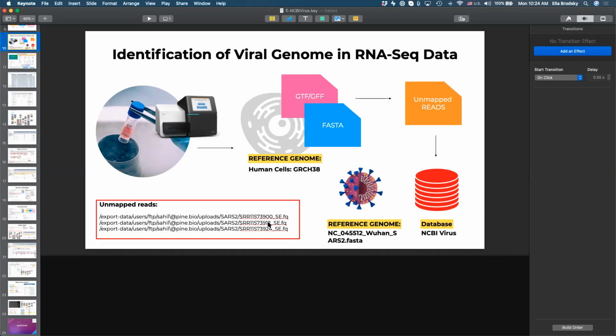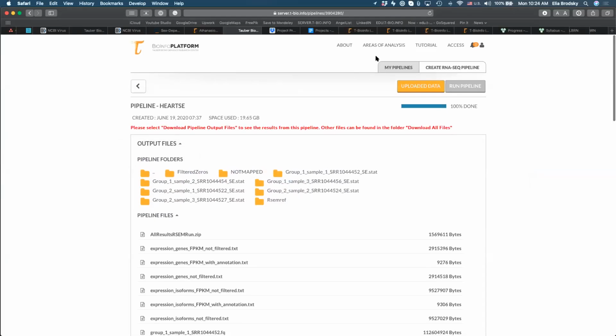Okay, so Sravia, let me show you again how to do this. I'm just going to take one of these just to explain. Okay, so if you get a link like this, right, you copy it, and then you go to areas of analysis.